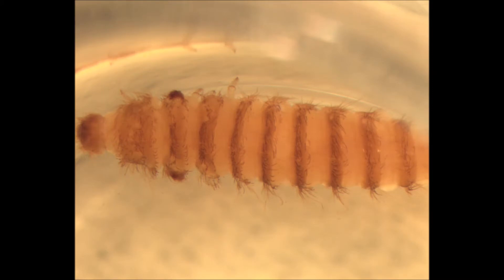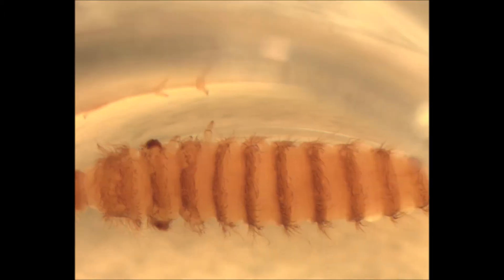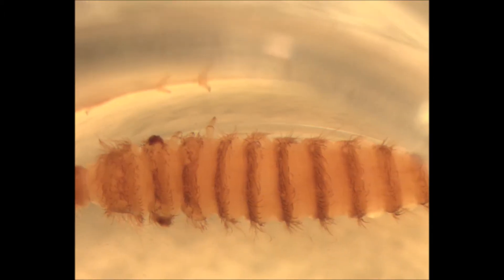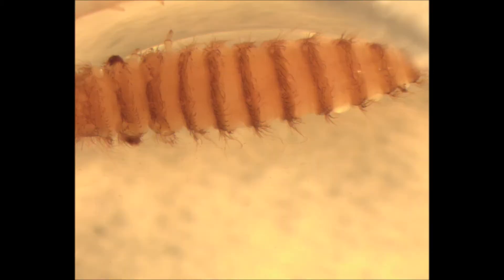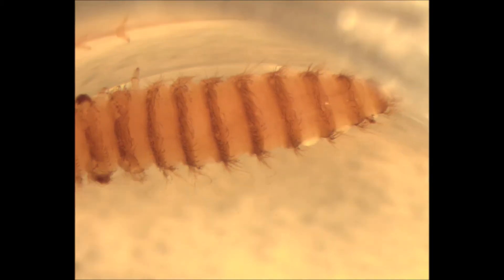We'll go and look at the larvae. This is a live view of the specimen under a dissecting microscope. We won't get to see the larvae under the compound scope once the slides are prepared because I don't have a good camera that I can mount on there.